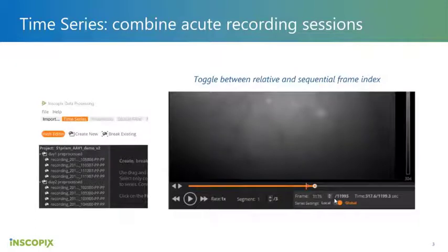Yeah, no, I mean, if I remember, there were some issues with doing time series with TIFF files. I don't know if it's still the case right now, but there can be, because TIFF files don't save the timestamp information. I think it's a good point.